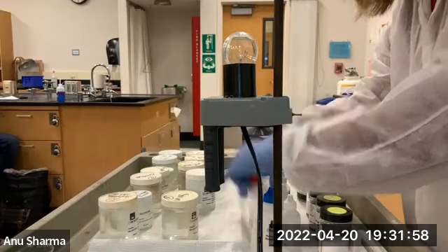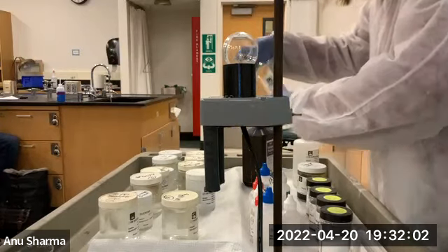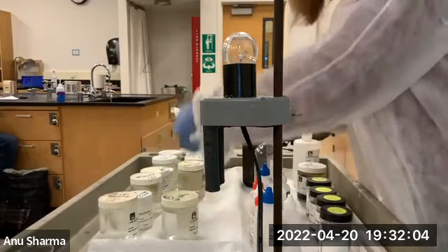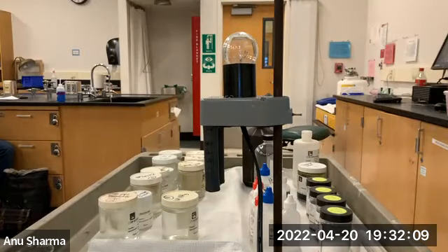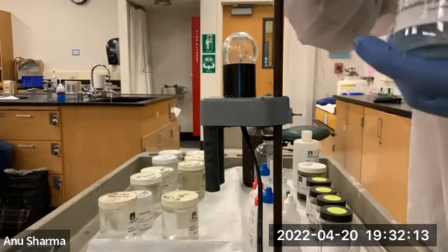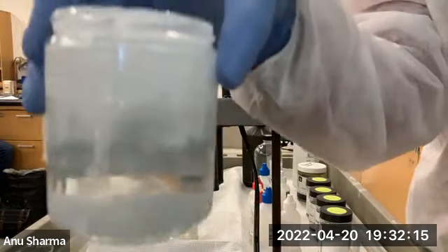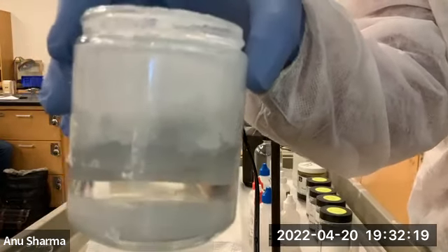Barium hydroxide, okay, I want to show you how it looks. You see that? So it is soluble in water, as we looked at.